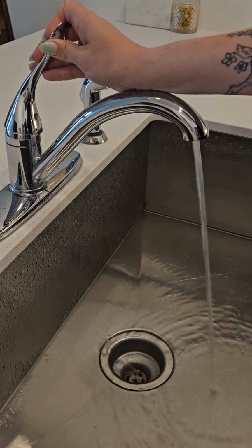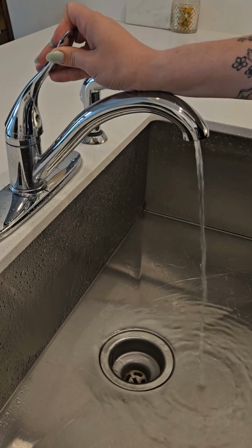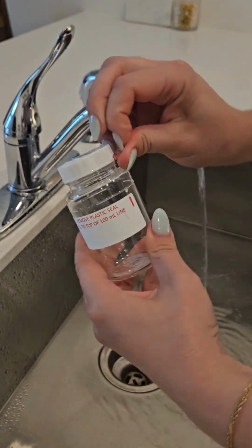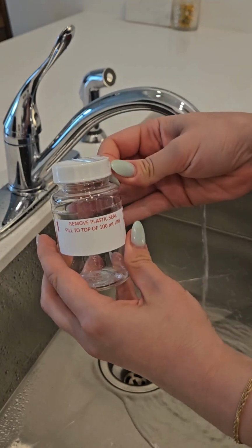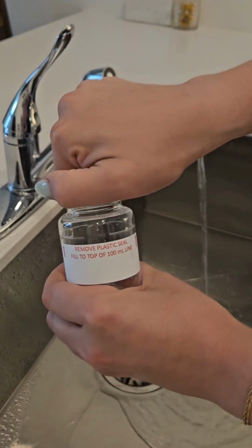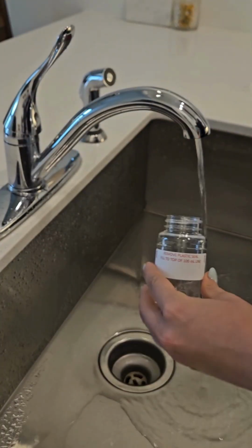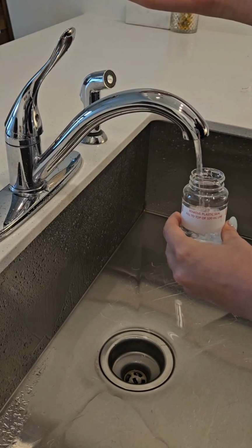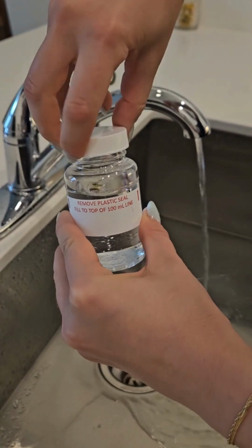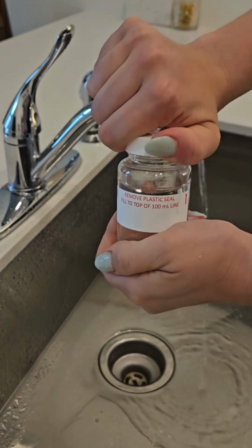After the 10 minutes have passed, slow the water down until the stream is the width of a pencil. Remove and dispose of the clear plastic seal around the bottle cap. Carefully remove the cap, being sure not to touch the inside of the cap or bottle. Fill the bottle to the 100 milliliter fill line and securely replace the cap. It is crucial to record the time and date this sample was collected on the sample information sheet.